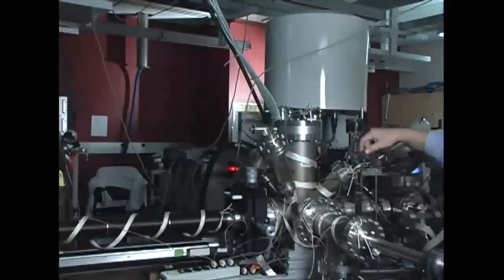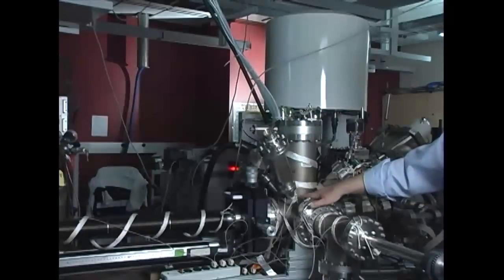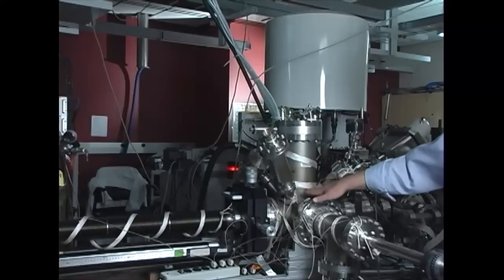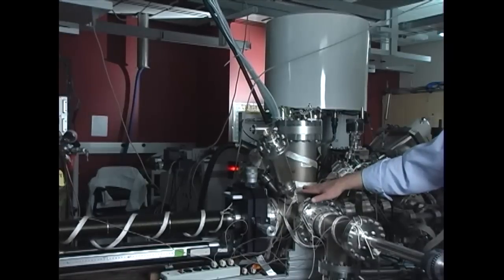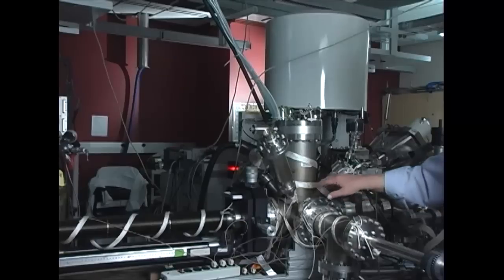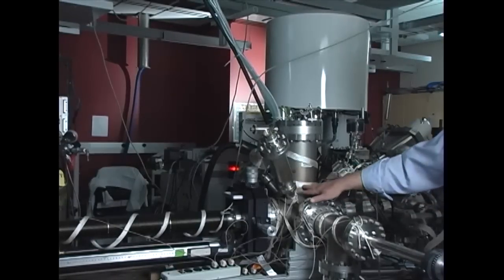So the process will involve creating the atomically clean surface. We can transfer it into this chamber for analysis to verify that it's atomically clean, bring it back over here to do the electron diffraction experiment. Then we can deposit an organic layer over the top of that, again in another part of the chamber, bring it back in here and re-verify that we have a very well-ordered organic film.